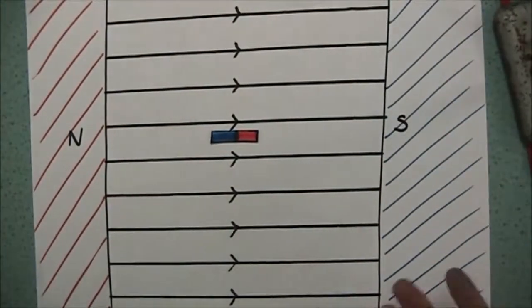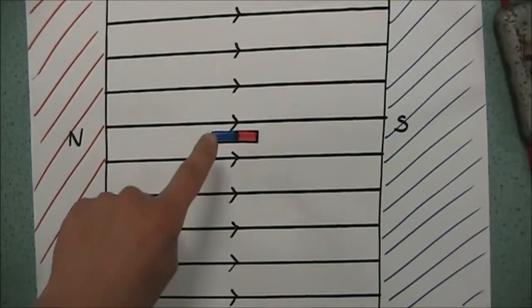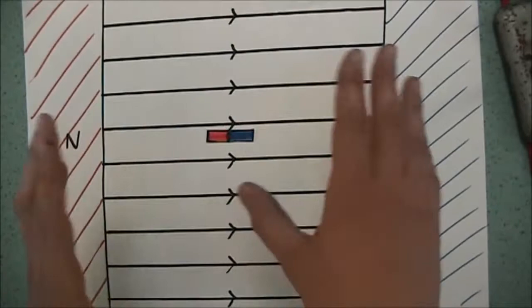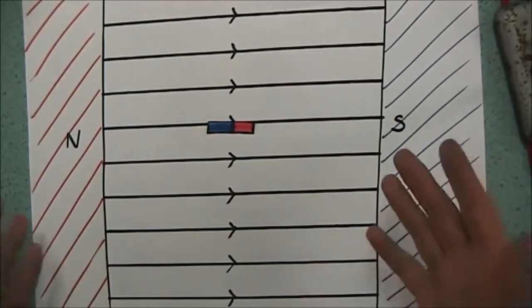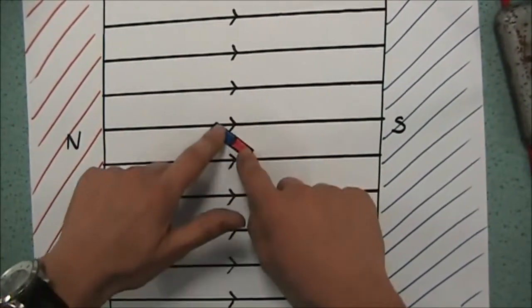The north end of the magnet will attract to the south, and the south end of the magnet will attract to the north. But if I put it in like this and I let it pivot freely, then actually it will spin itself back. But it won't go directly there. What it will do is probably spin itself back, overshoot and wobble a little bit like this.